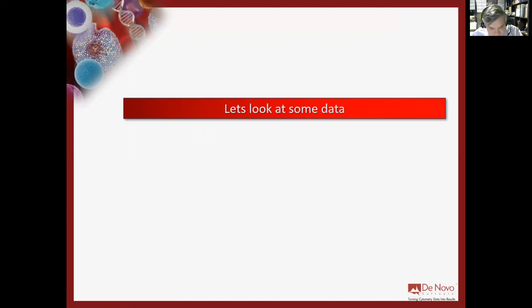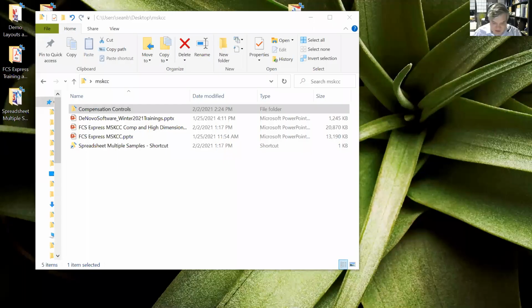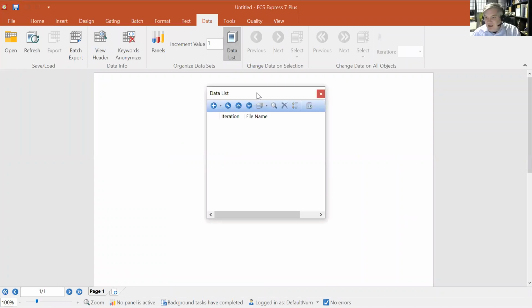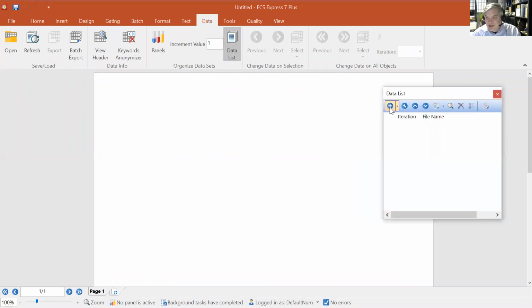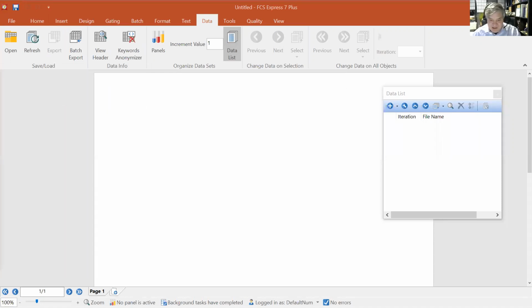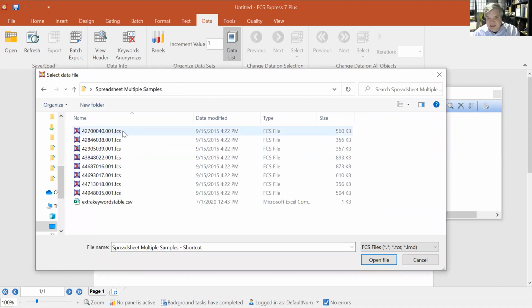Again, we're just going to spend a few minutes actually running tSNE, because tSNE is actually that easy to use in FCS Express. But again, I wanted to share those common pitfalls that people run into. So when we get started analyzing some data in FCS Express, one of the places to start is to get some data loaded up into your layout. So I'm going to grab some data I want to run tSNE on, and I've got 3 files I want to compare.